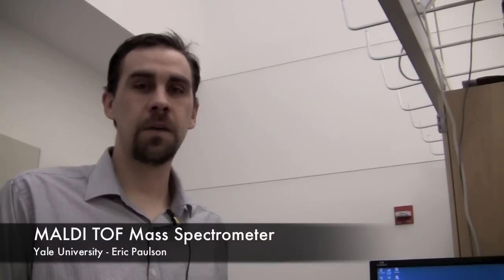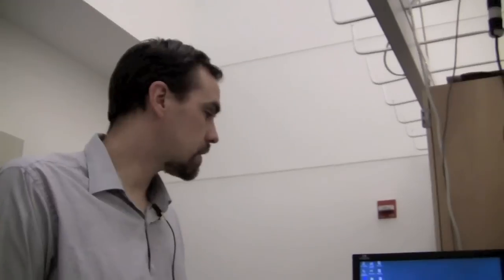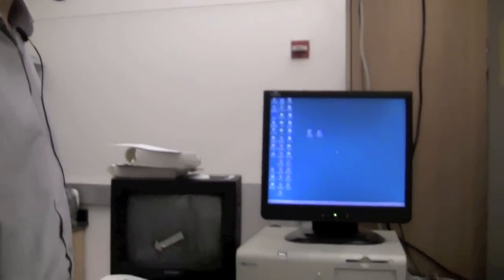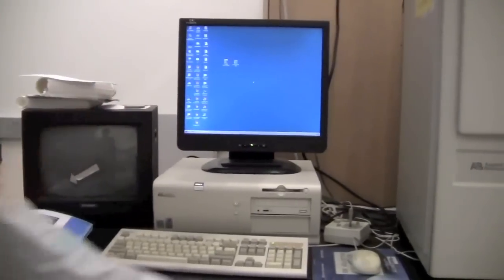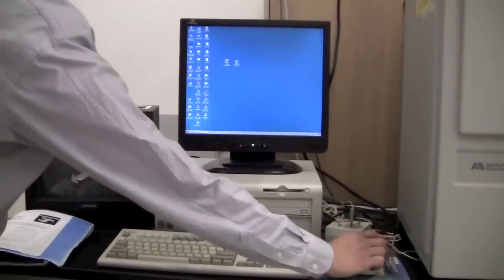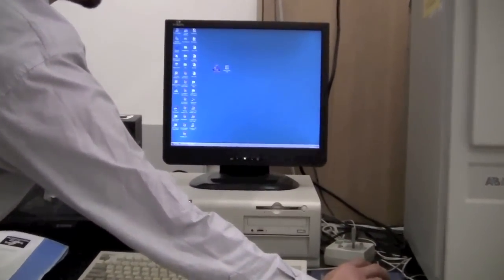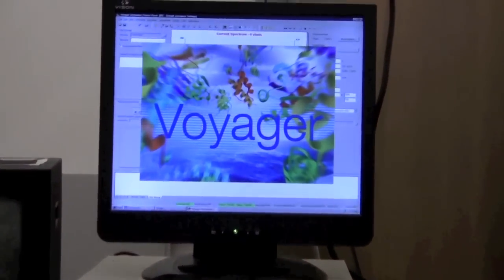This is an explanation of how to use the MALDI-TOF mass spectrometer. When you come to the instrument, the software should already be running, but if it's not, you can start it using the Voyager control panel icon. Double-click on that and it should start the software.